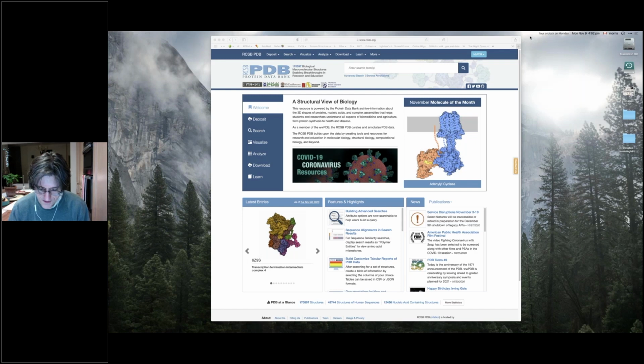I'll point you to a good resource on selection algebra. I'll talk about how you represent molecules, labels, how you can build measurement objects. I'll try and show you some mutagenesis. I'll show you a little bit about crystal packing and how you can generate the crystallographic images in a crystal structure. I'll try and touch on movies as well, but I'm also very open to questions as we go.